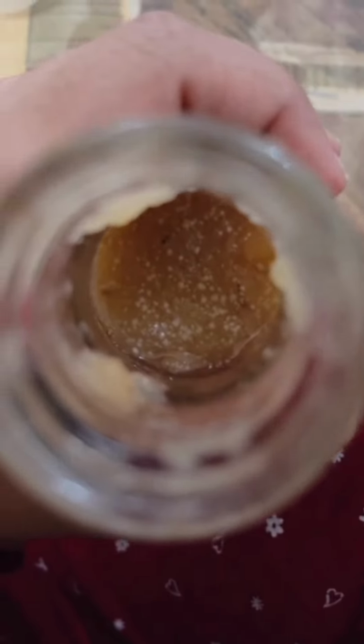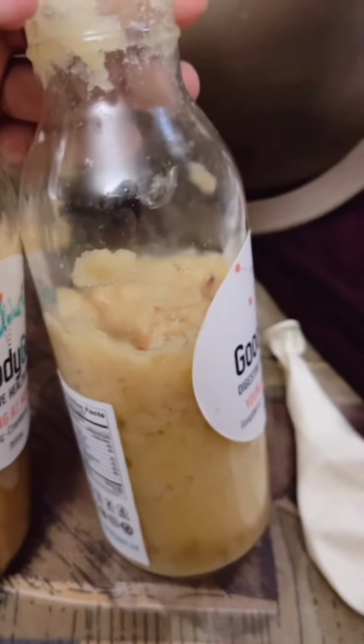The control was contaminated since there was formation of white colored colonies in it. However, no such colony was observed in any of the other bottles. The color of the control, which is this one, is also very different from the other bottles.